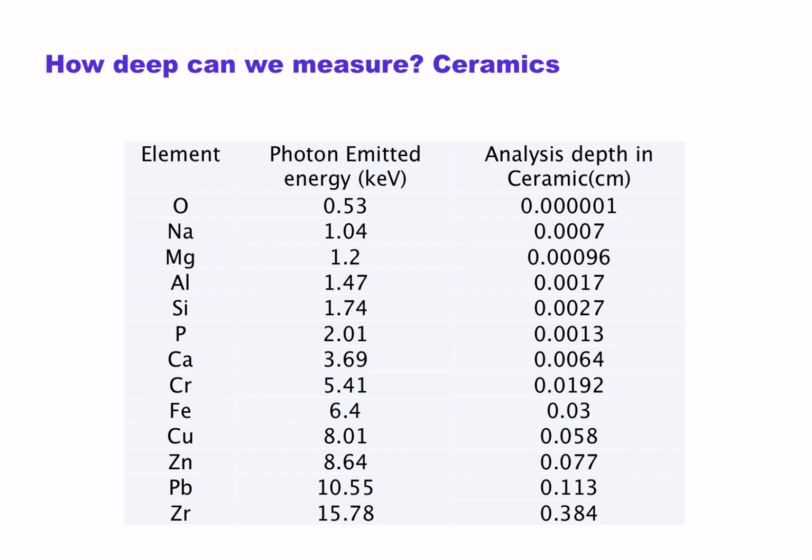Now, this is important first because you're measuring each of these elements at a different depth. So even if you're measuring a sample that is pure iron oxide, let's say its first oxidization state, X-ray fluorescence still cannot tell you whether or not it's oxidized. Why is that? Well, you're measuring your iron at about 0.3 millimeters deep, but the oxygen is being measured less than a micron at the surface. So as a consequence, you can never really prove that oxygen is bound with iron, even with statistics, though they should roughly line up, but only roughly.